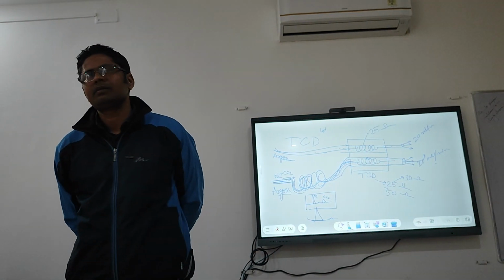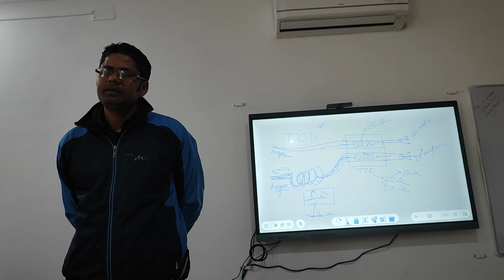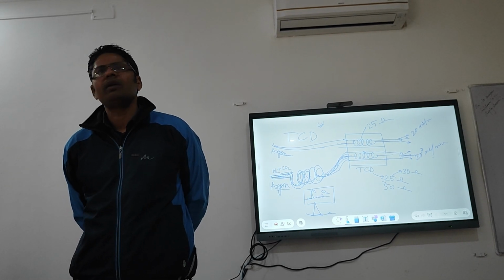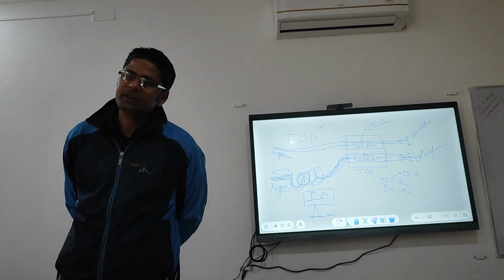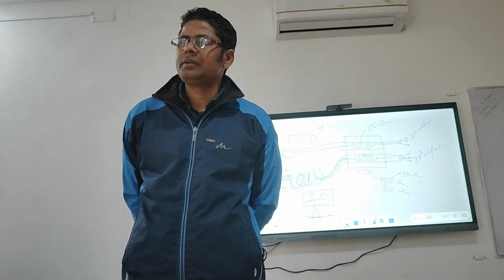TCD is non-destructive in nature. If you are injecting a sample into a column, and at the column outlet you are installing a TCD detector, TCD is non-destructive. That means your analyte will not be destroyed when it goes through the detector.